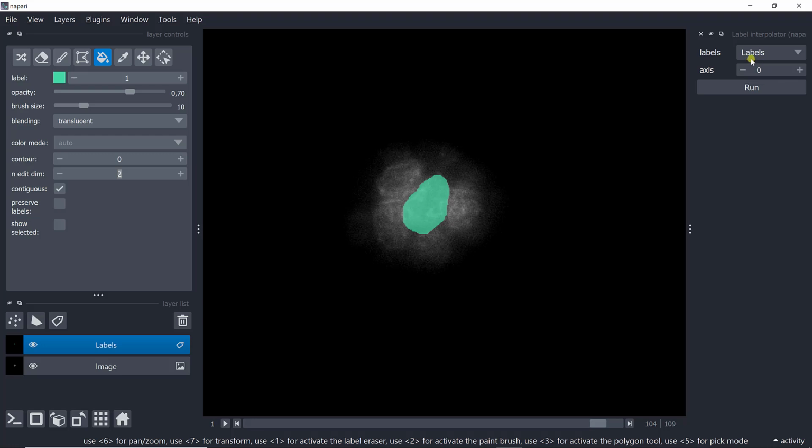And then which axis. You need to remember that here we're in Python, so the order of the axes, most of the time, is Z, Y, X. So the first axis, axis 0, is Z. So that should be Z. I chose this image in particular because, if you remember, maybe not, if you saw the previous video or the one before, I opened the Zarr format of the image. In Zarr, the image is split into chunks of data, and so the first dimension is not Z; it's chunks in ZYX.